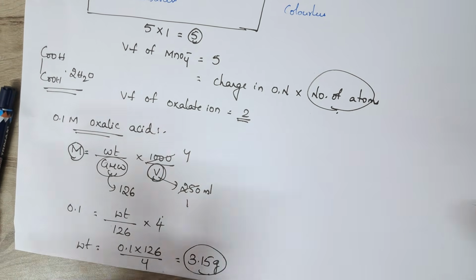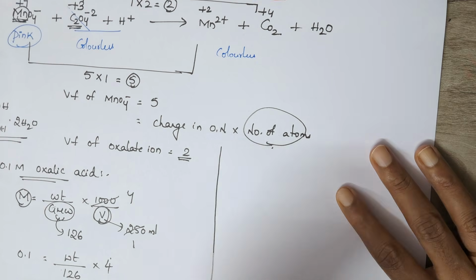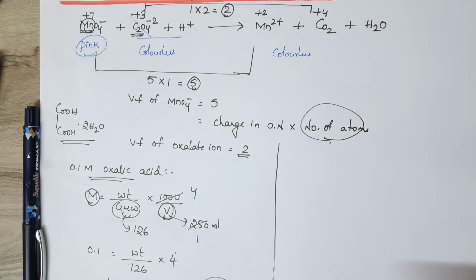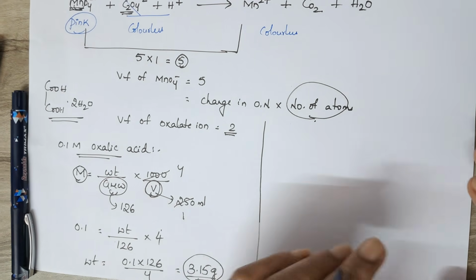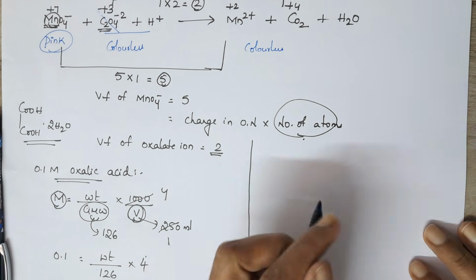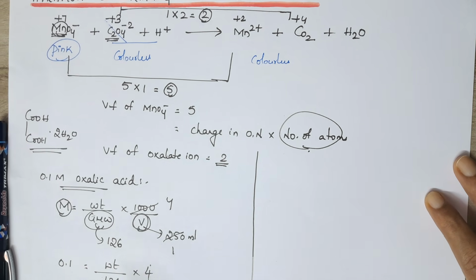That is the procedure. Okay, do you understand this? Ma'am, then how do you prepare the KMnO4 solution? See, the KMnO4 solution you need not prepare; the lab in charge will prepare it. I will tell you that calculation at the end. Now, in the exam, what you have to do is write this and do this calculation.